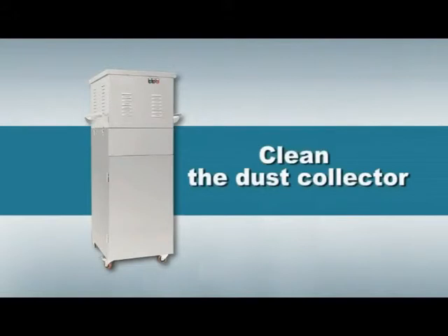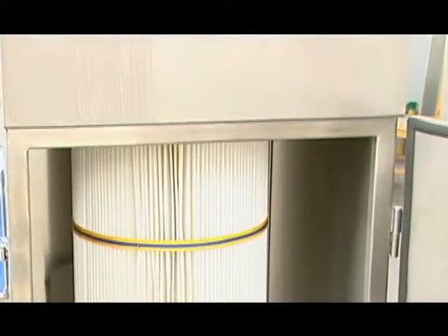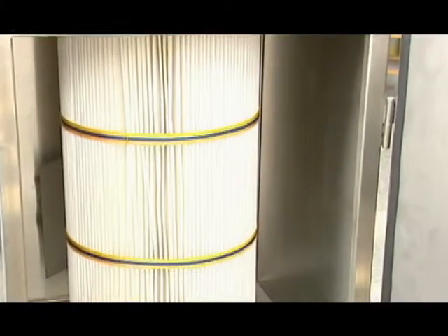Clean the dust collector. Pull down the cartridge filter of the dust collector and clean it with clean water. After cleaning, the dirt of the dust collector should be cleaned with medicinal alcohol and installed in the opposite direction.